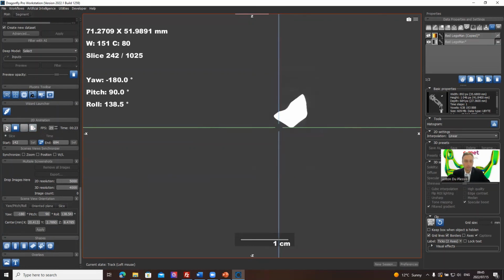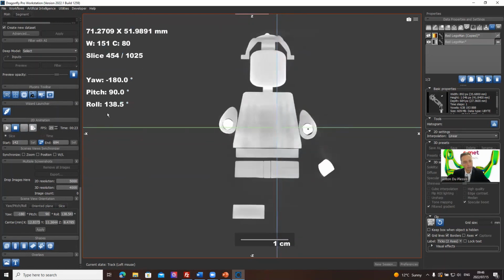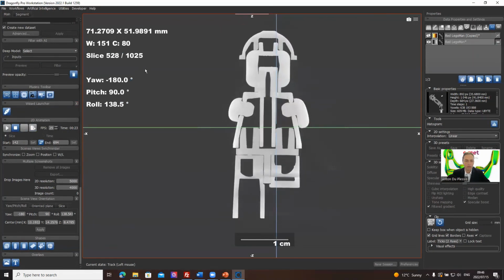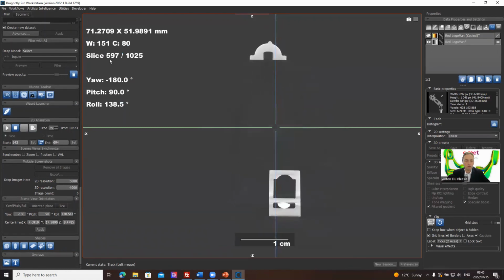This is what the video is going to look like. I'm not going to go and find it now, just to demonstrate how to make a slice video like that. I should have put these text annotations off before making the slice video, but it's actually quite nice to have it there, because if you're sending this to someone, they might want to tell you, look, in slice 605, there's something interesting, for example.